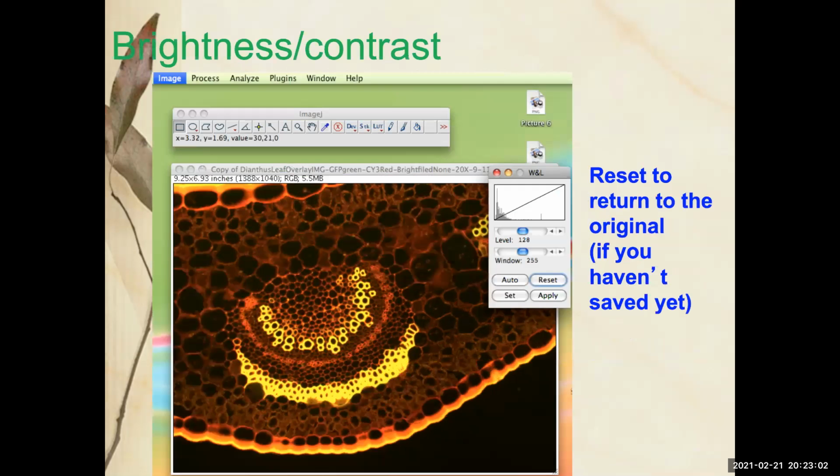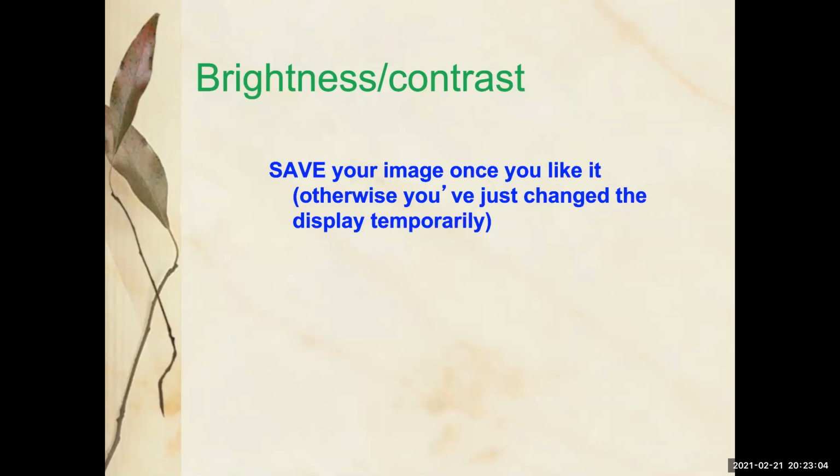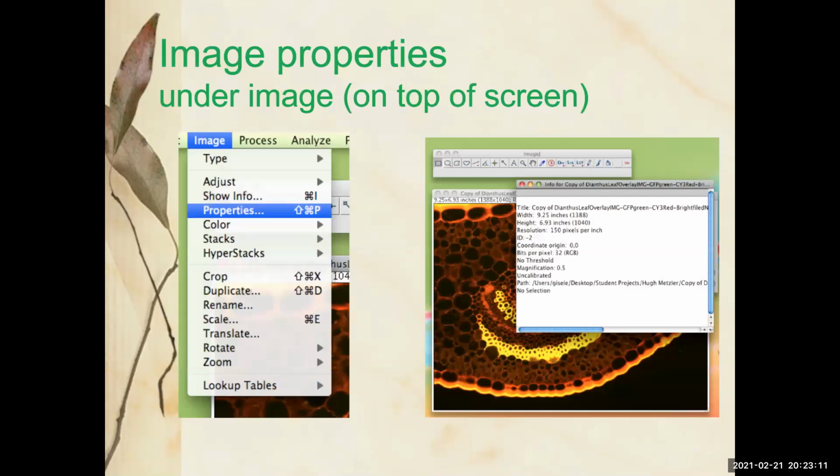That's really cool. You can reset, which is really important. You saw me do that. Once you like it, save it. Otherwise, it's only changing the display.